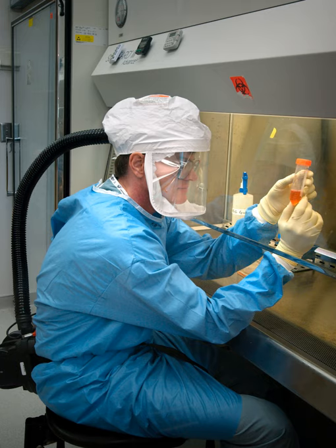Topic: Ergonomics. Biosafety cabinets are used on a daily basis for hours. Besides protection of user and sample material, the human design factors, ergonomics, of the work become more and more important.